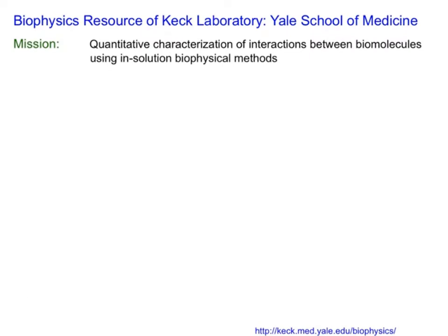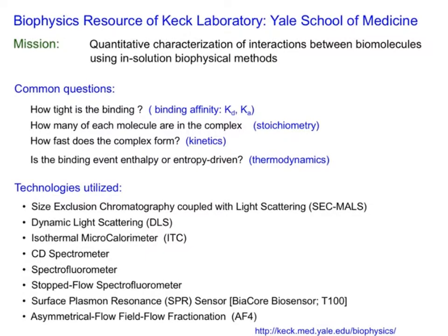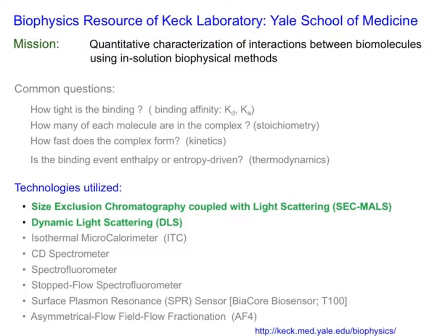All the data I will be presenting today were collected at the Biophysics Resource of Keck Laboratory at Yale School of Medicine. The mission of the resource is to provide biotechnology support that allows quantitative characterization of interactions between biomolecules using in-solution biophysical methods. We assist investigators in measurements of binding affinity, stoichiometry, kinetics, and thermodynamics of complex formation. To assist in these measurements, we house multiple technologies, among those light scattering instrumentation, microcalorimetry, CD spectrometry, stopped-flow spectrometry, and surface plasmon resonance biosensing. Out of all this technology, today's webinar will only talk about the results collected utilizing light scattering, either static or dynamic, in line with size exclusion chromatography.